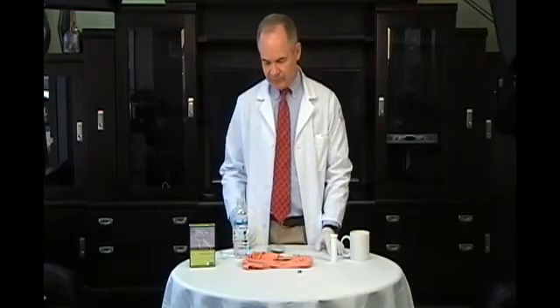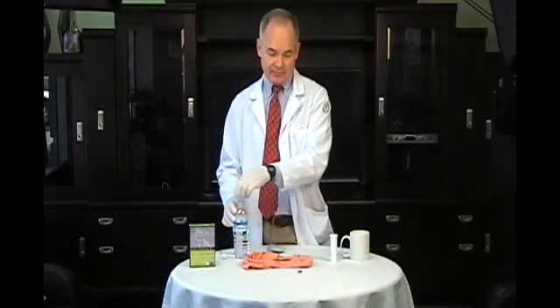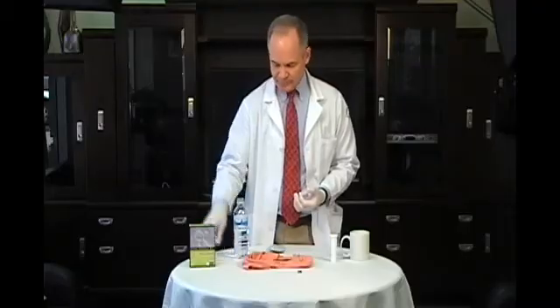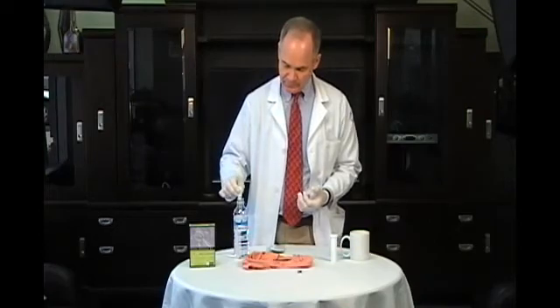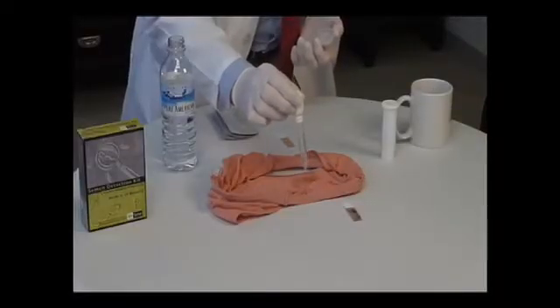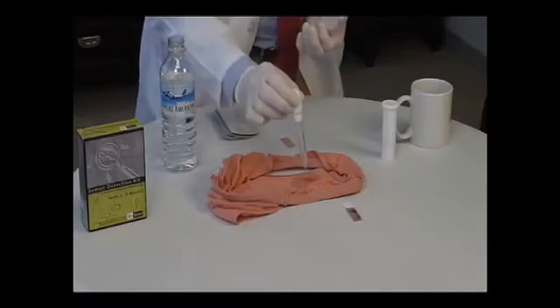What I'm going to do now is demonstrate yet another technique, because there's a possibility that this purple dyestuff may transfer to the fabric. So let's just get it wet just a little bit more for the purposes of this demonstration.